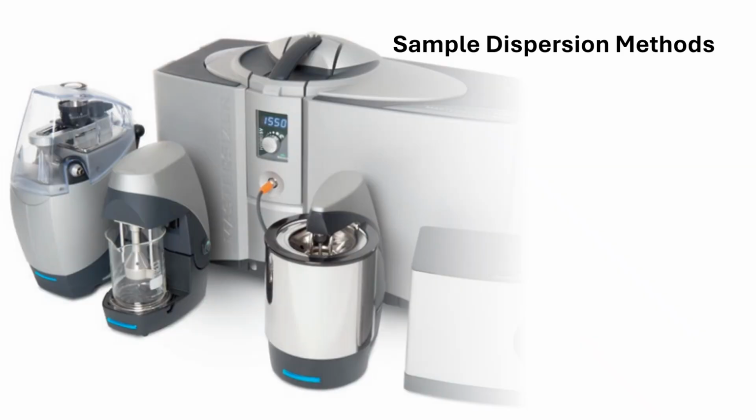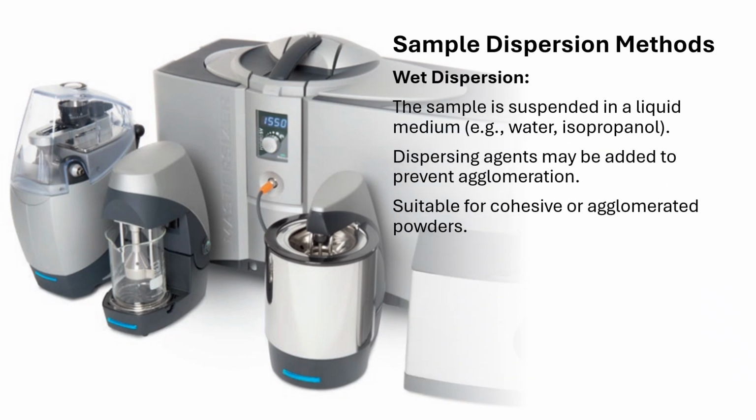So now we will discuss the sample dispersion methods. Already we discussed the hardware components, that is for dry and wet. So let's discuss the wet dispersion. The sample is suspended in a liquid medium, for example water or isopropanol. Dispersing agents may be added to prevent agglomeration, so it is suitable for cohesive or agglomerated powder. Wet dispersion ensures particles are well separated in a liquid, minimizing clumping, and it's useful for fine or sticky powders that naturally agglomerate, right? Dispersing agents or surfactants help to maintain individual particles in suspension for accurate measurement.